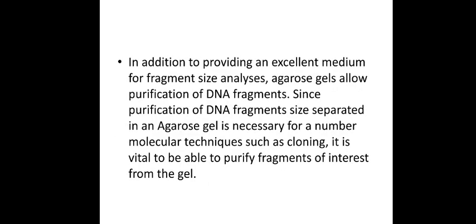In addition to providing an excellent medium for fragment size analysis, it also allows the purification of the DNA fragments. Since the DNA fragments of a particular length are going to be together, you can separate them out. You can select a DNA fragment of your interest, and then it can also be used to analyze. Sequencing can also be done.